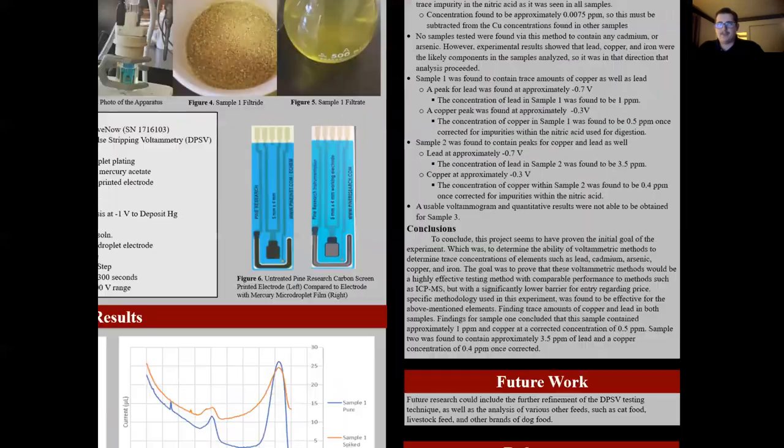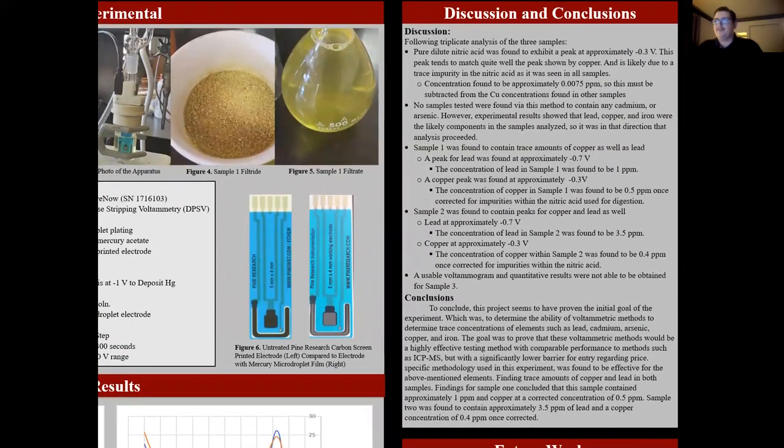For the results of this research, pure dilute nitric acid was found to exhibit a peak at about negative 0.3 volts. This peak tends to match quite well with the peak shown by copper and is likely due to some sort of impurity in the nitric acid, as it was seen in all samples. The concentration was found in pure nitric acid to be about 0.0075 ppm. This must be subtracted from the copper concentrations found in other samples.